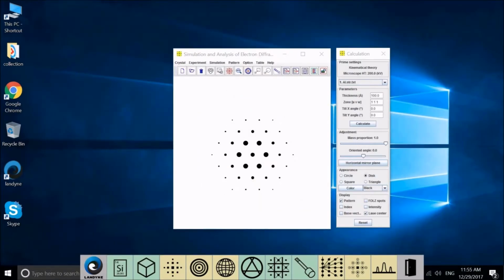In our file list, you can see here is the default aluminum, and this is the reloaded aluminum file, and this is the bismuth platinum file. I mentioned that we have clean all here, remove all here. That will clean the list.